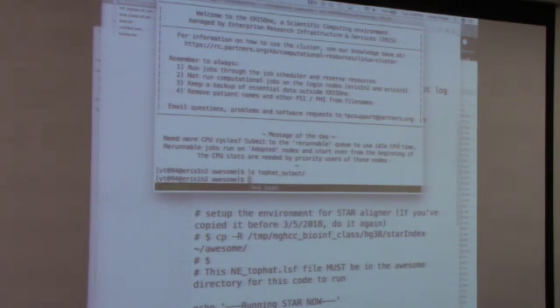But it's in the awesome directory, FASTQ files is where it should be. You don't have the practical lesson. Can you show me the command? Well, in the command for your type command, just open your file.